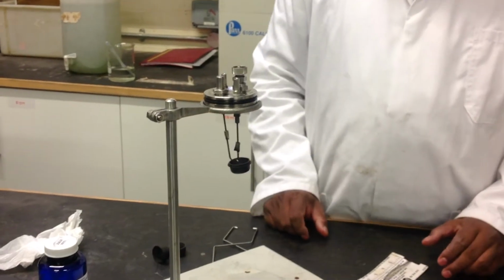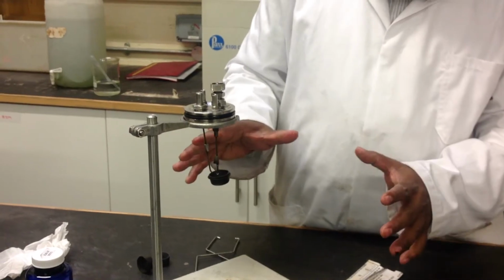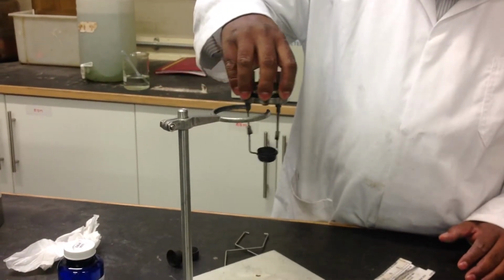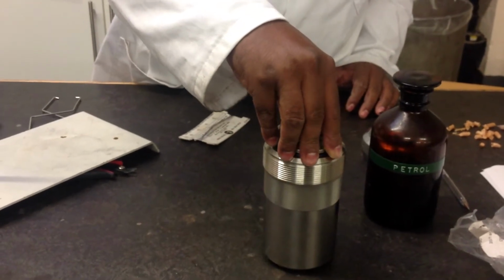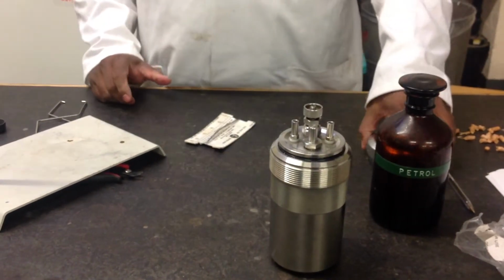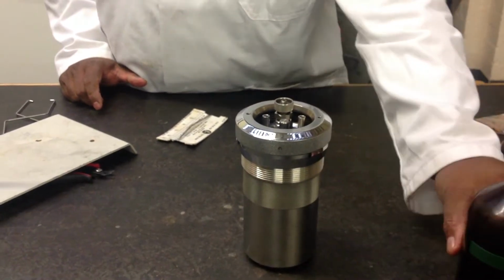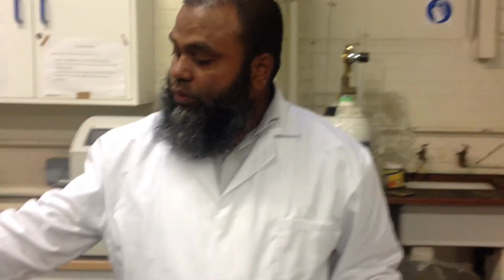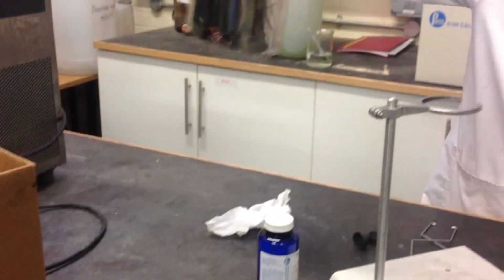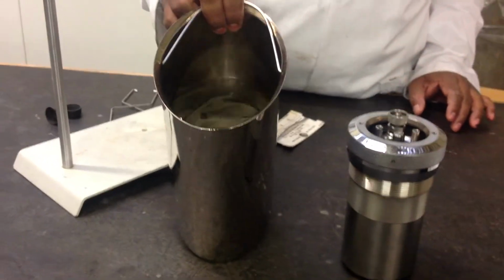Yeah. And then after connecting this fuse wire, we put this sample inside this container, and then we close this big screw cap. After closing the big screw, we put this vessel in this big bucket here, and there is water in this bucket, you can see.